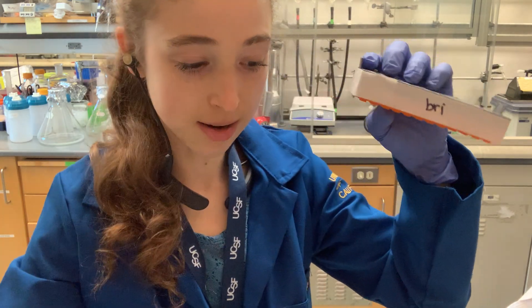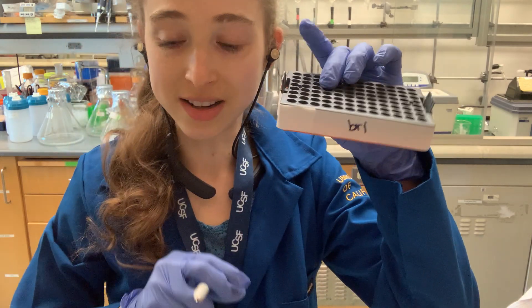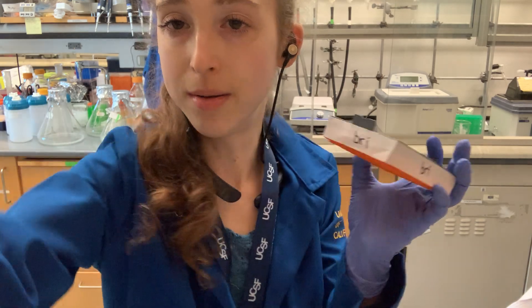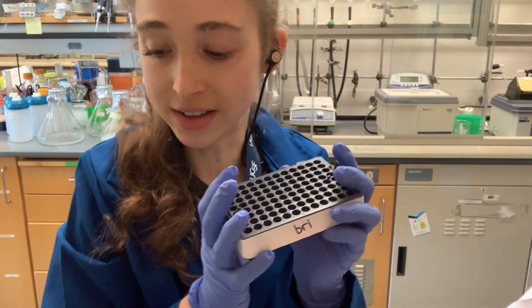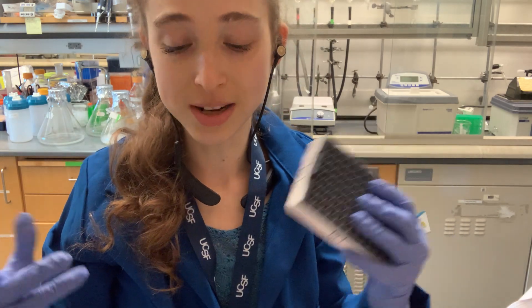I always put my name or initials on it so I know it's mine, and if I leave it somewhere people know it belongs to me.